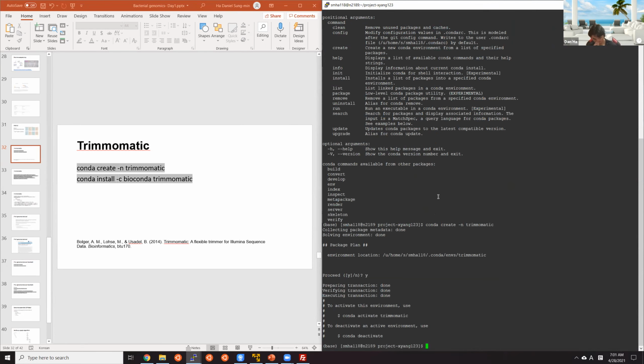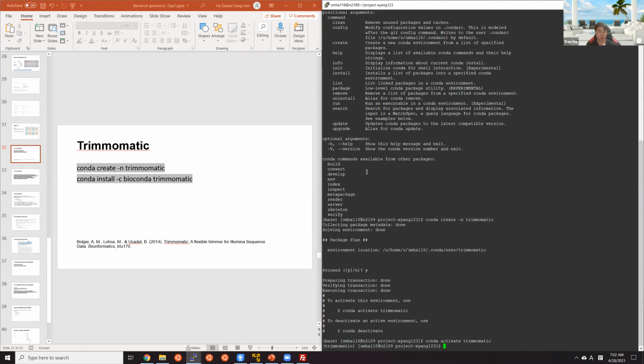Type in yes. And after that, we're gonna activate the environment. Conda activate Trimmomatic. Make sure you're on the Trimmomatic environment with this Trimmomatic sign up front.